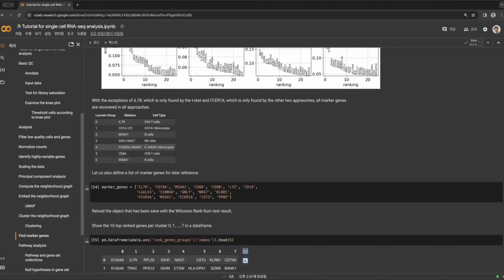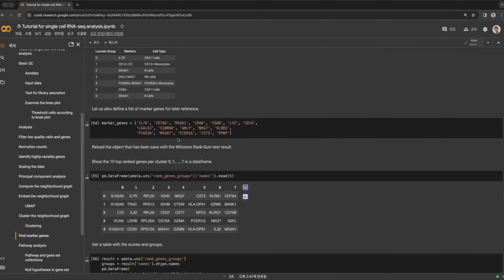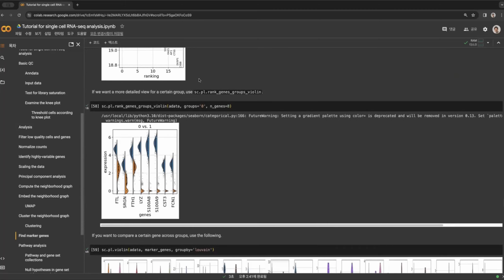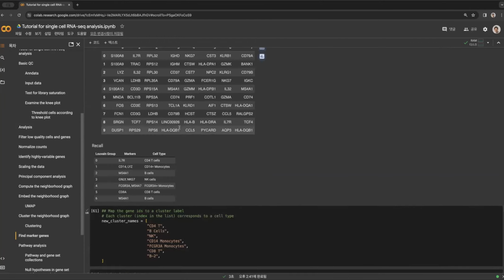If you use this information, then you can judge which markers are represented in each cell type. You can go the manual way. Then you see cell type 0 is doing something, or cell type 1 is doing something. So it is also sort of a manual way to think about the relationship.